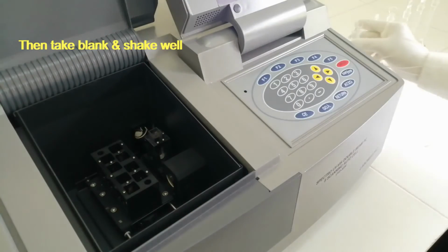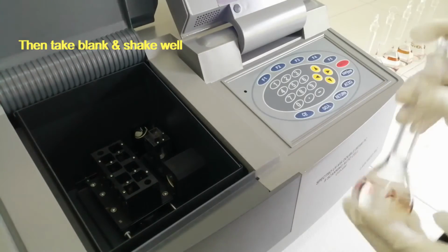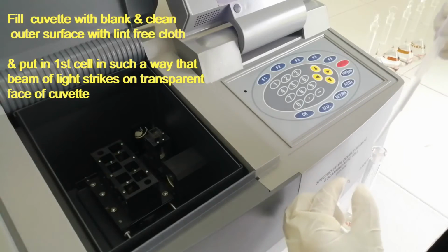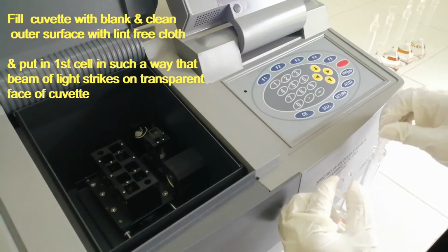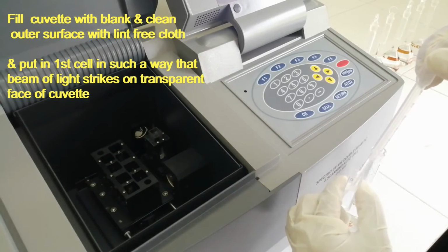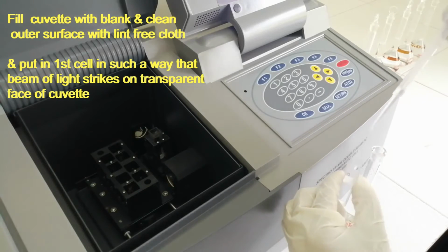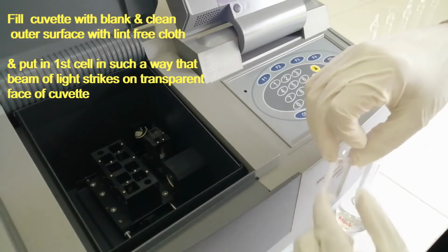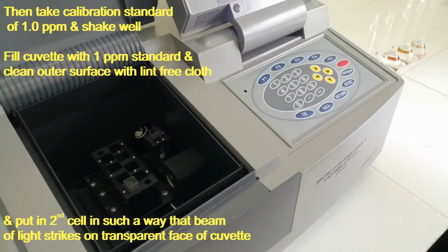Then take blank and shake well. Fill cuvette with blank and clean the outer surface with lint-free cloth. And put in first cell in such a way that the beam of light strikes on the transparent face of the cuvette.